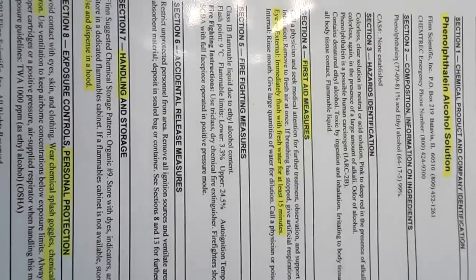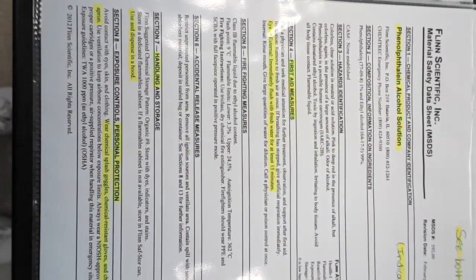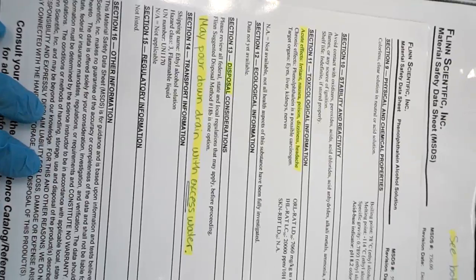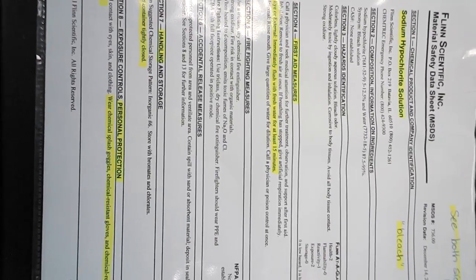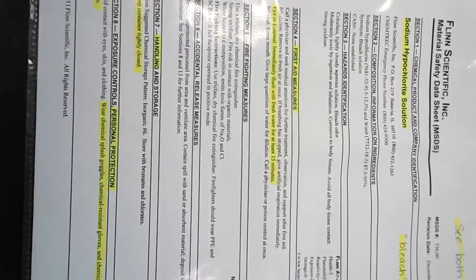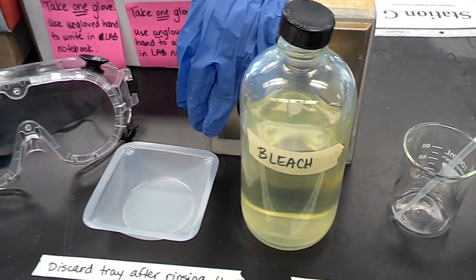Okay, here's the MSDS for the phenolphthalein solution. It tells you your first aid measures, the wear of the chemical goggles and gloves and the apron. And on the back it tells you how to dispose of it and what would happen. Here's the MSDS for the bleach or sodium hypochlorite, which also tells you the first aid measures, PPE, how to handle it, and then how to dispose of it. Always check your MSDS.